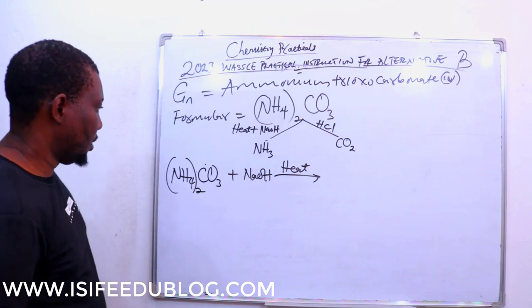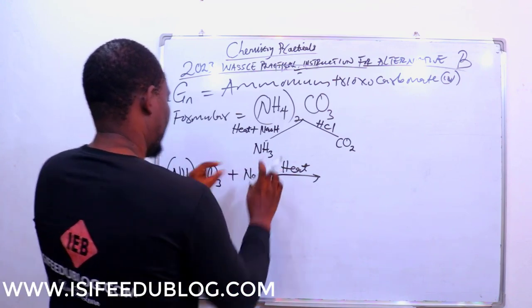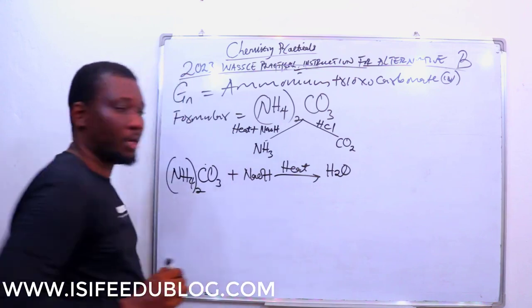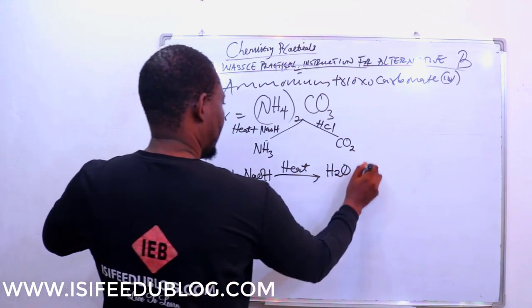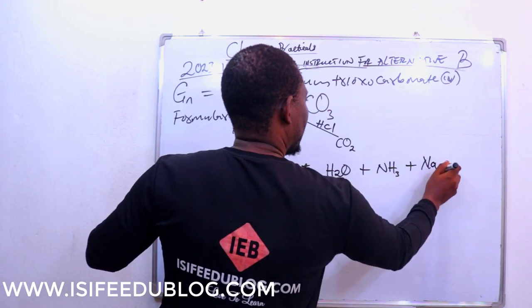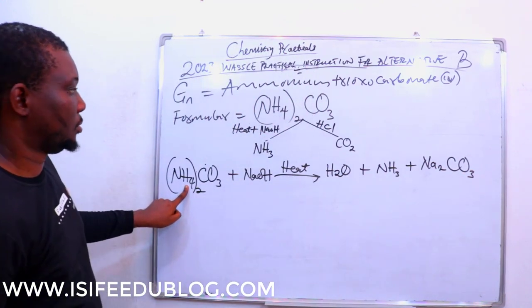Of course, water comes out, H2O, and remember that the gas is produced, and then sodium carbonate is also produced.